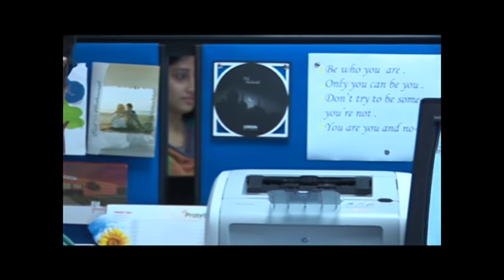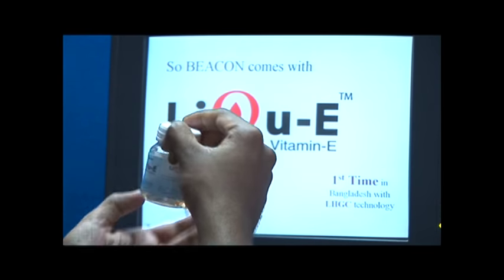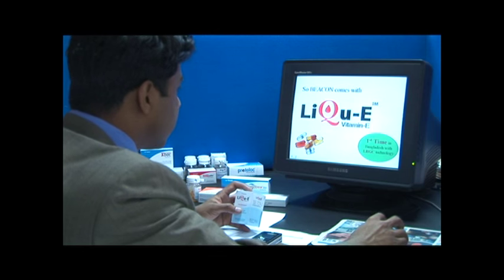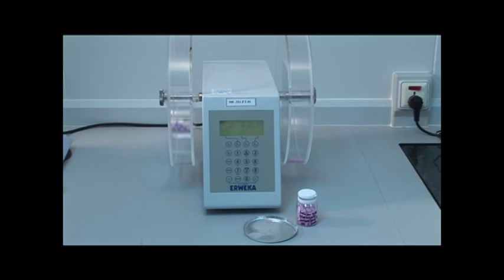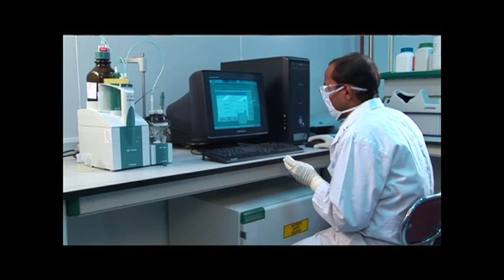Product quality is considered to be a prime determinant for successful marketing of pharmaceutical products. To achieve this objective, the project has been equipped with modern machinery, skilled and experienced manpower.